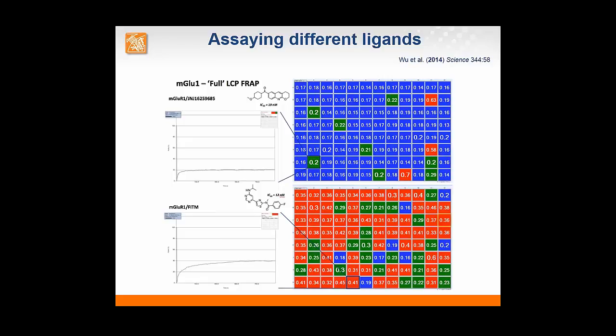And it's often not possible to predict which ligand can actually be successful for crystallization. Just affinity is not a sufficient parameter. Also, we looked at the stabilizing property of the ligand in solution, but that's also not the whole story. Well, we found that the diffusion of the protein in LCP is a better metric for selecting the best ligand.